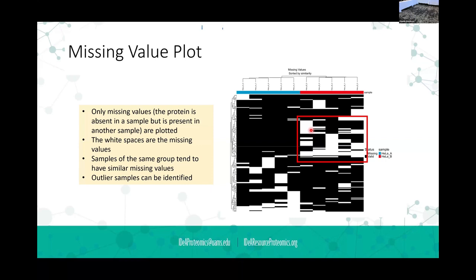Yep, that's right. So one of the things that Mike does in his targeting work is he spends a lot of time, when people say, I want to look at this protein, saying, well, let's see what peptides we can actually see. In his talk, he'll talk about best flyers, because it's not just about concentration, it's about having peptides of a certain size, of a certain makeup, and again that are not masked by other PTMs, that will allow you to be able to see it.